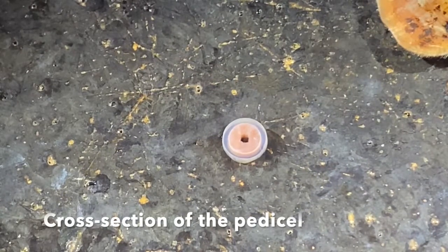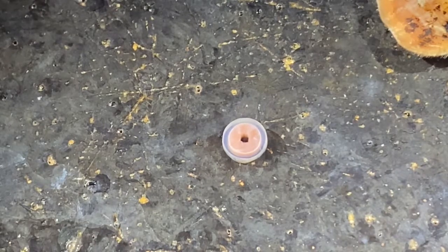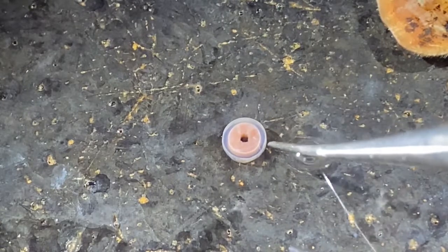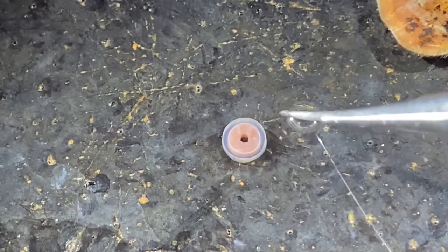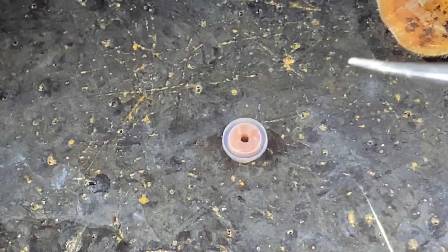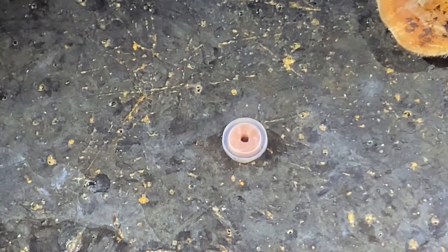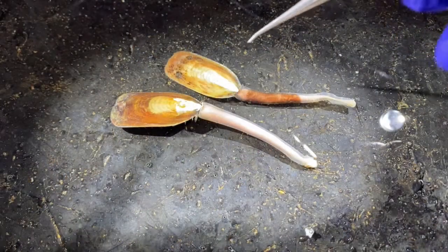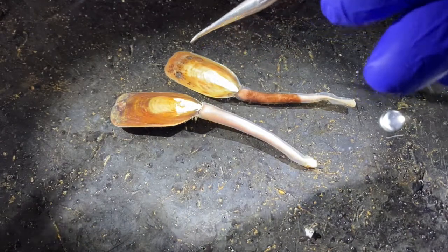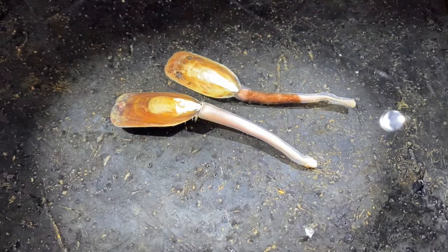Okay, what I've done here is I've taken a cross-sectional slice through the pedicel. And so what you can see out here, this clear material is the cuticle of the pedicel, and this pinkish material, the ring in the middle, is the muscle of the pedicel and has that lumen or the space in the center. You can also see in the shell these concentric rings. This is the oldest part of the shell, and the youngest part of the shell is out here.